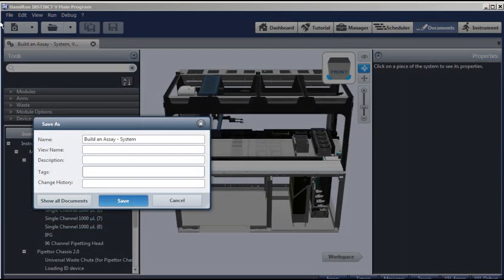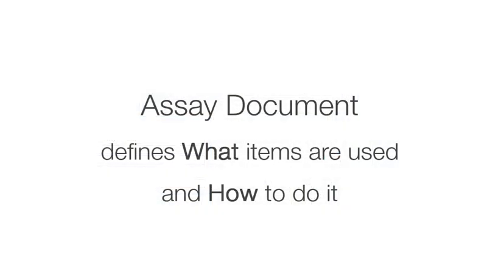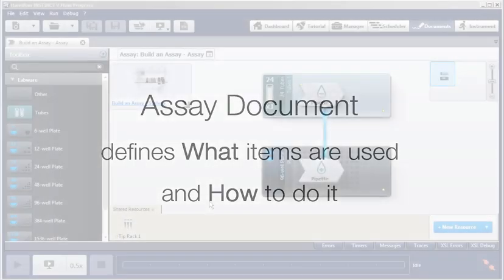We'll save our document with a descriptive name. Now we can move on and build our assay and define what items will be used and how the pipetting will be done.